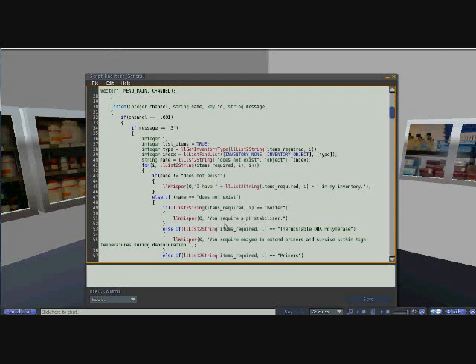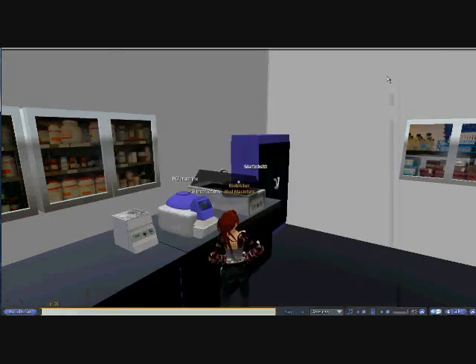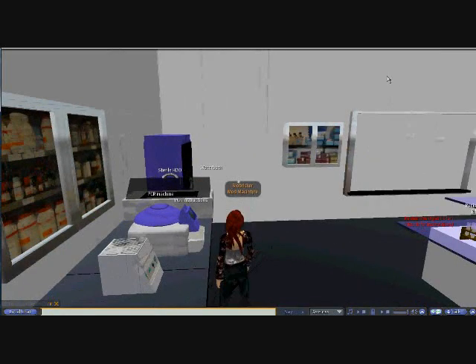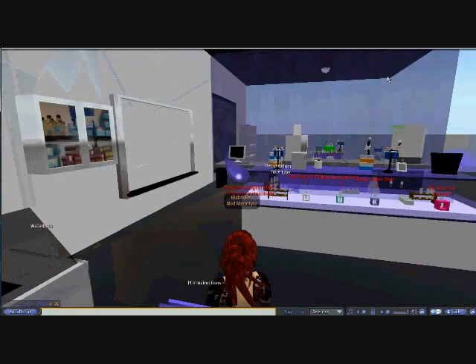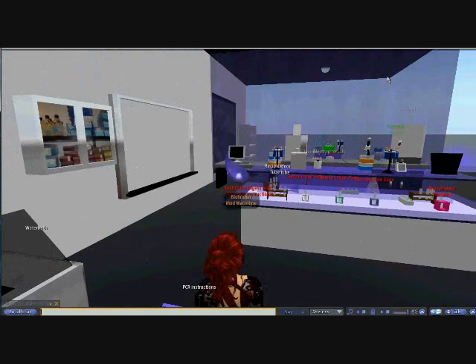If something that is required does not exist, then you may give out hints about the object once you determine what object is missing by using conditionals.